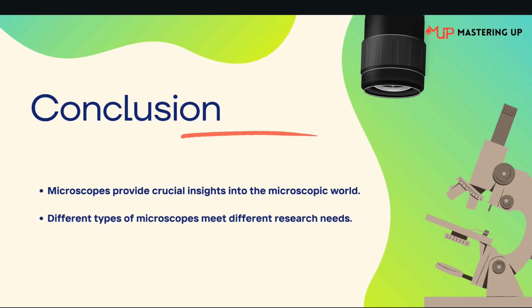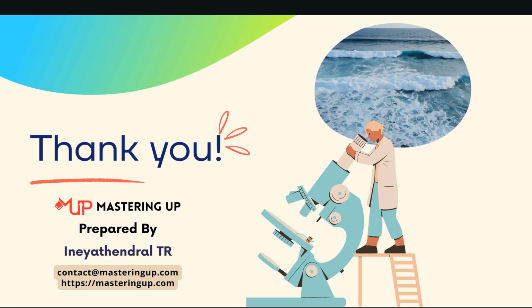In conclusion, microscopes are essential tools for unlocking the secrets of the microscopic world. Each type of microscope, from the light microscope to the electron and fluorescent microscopes, serves a unique purpose, offering different perspectives on cellular structures and processes. Understanding how they work allows us to appreciate the remarkable complexity of life on a microscopic scale. This drives scientists to discoveries and advancements in fields ranging from cell molecular biology and medicine to material science.